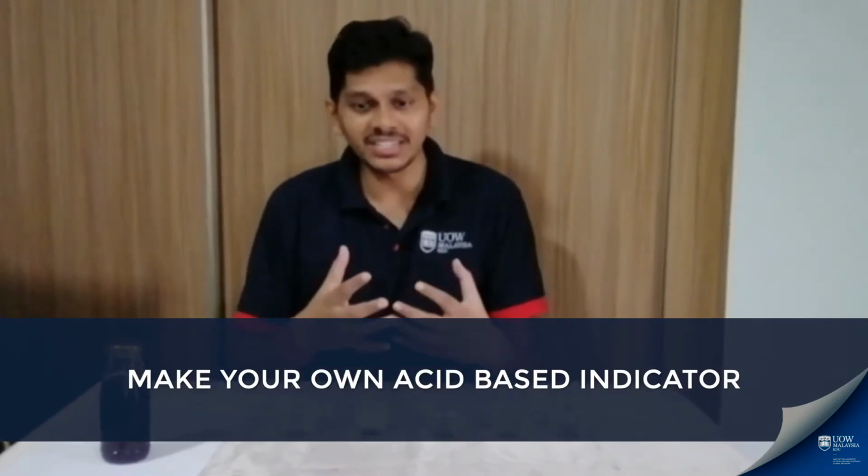I am Mr. Vijay. What we are going to do today is I'm going to teach you how to make your own acid-base indicator. Now an indicator is a chemical compound that is able to change colors depending on what you add it into. Some examples of indicators that you might have come across are phenolphthalein, red litmus, blue litmus, and of course universal indicator that has a range of colors.